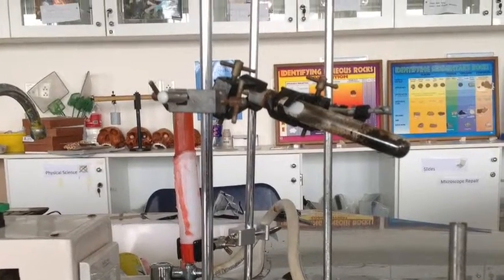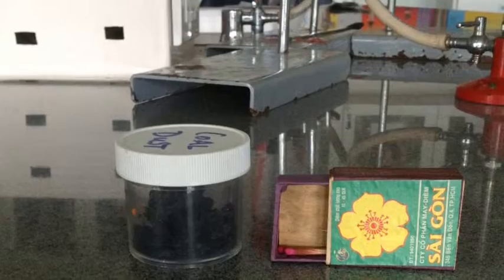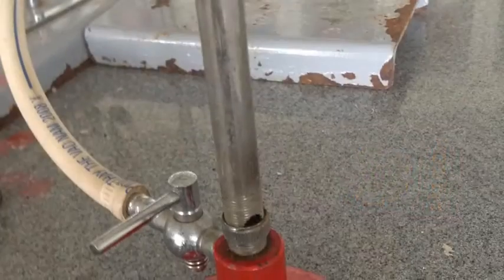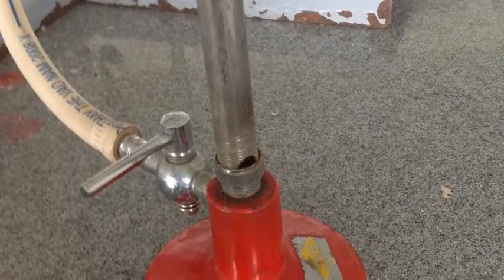This is the candle and the test tube. This is the coal dust we'll be burning and the match. This is the Bunsen burner we'll be using to burn our fossil fuel.